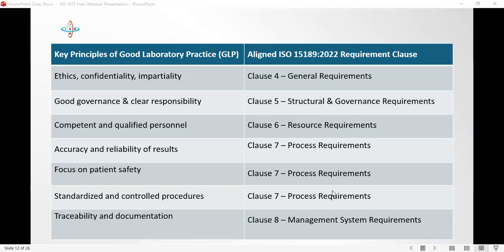What the quality officer does is to ensure that what you do is in the way you said you are doing it and it is yielding the accurate result that is desired. So the ISO 15189 requires every laboratory to have a management system that predefines these requirements per person.